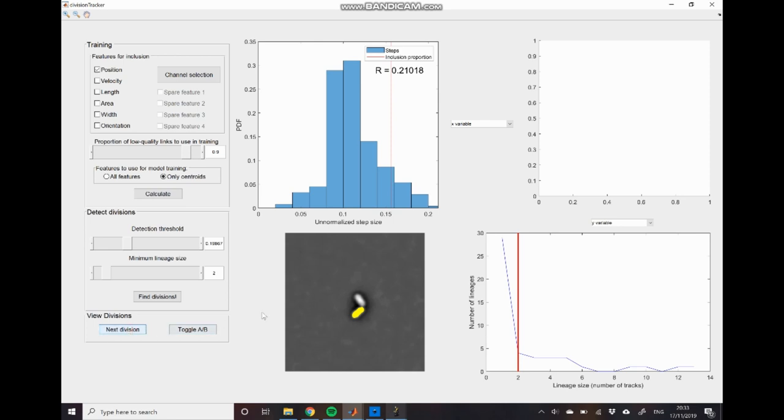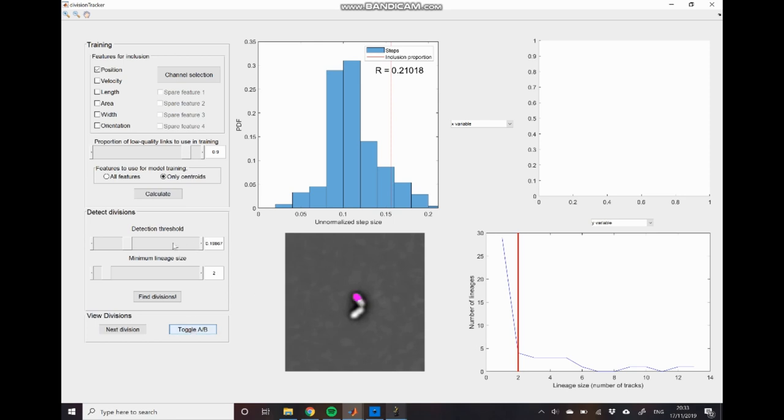We can also move to other division events that have been detected. In this case you can see that we've moved to the other cell at this time point but here you can see rather than both daughters being assigned to only a single daughter has been assigned. And so what this is telling us is that we probably need to reduce the stringency of the division detection threshold so increase this number here.